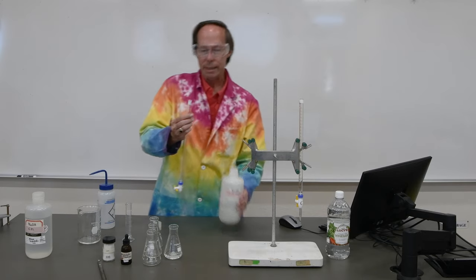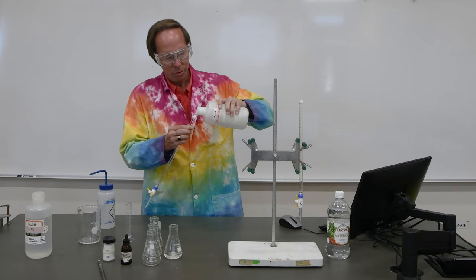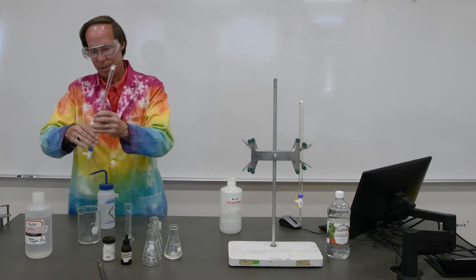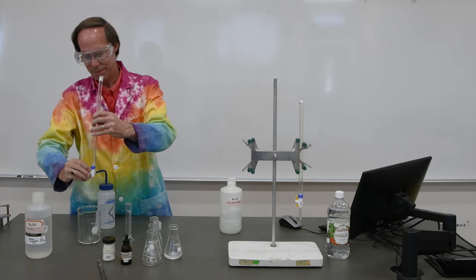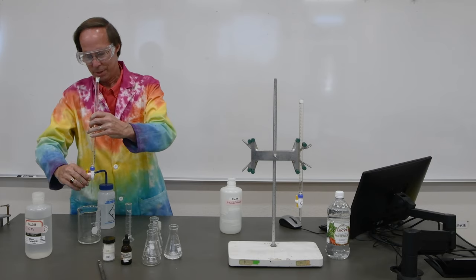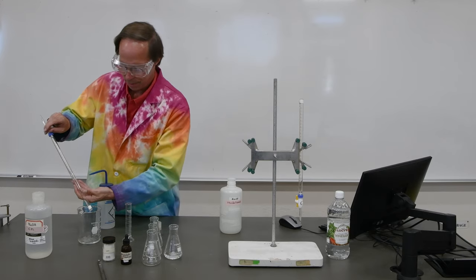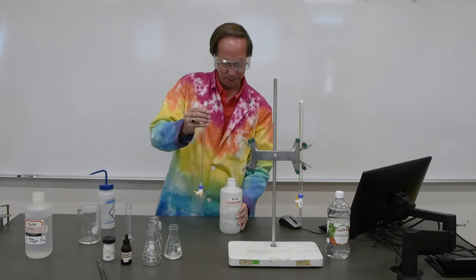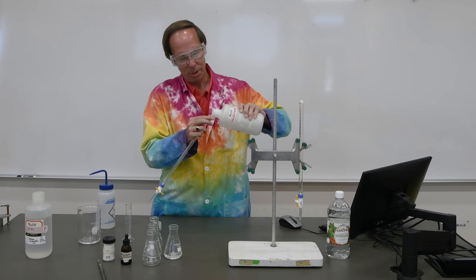Let's go ahead and do that again. It's always a good idea to put in two rinsings here to make sure there's nothing in the burette except the sodium hydroxide. So again, let's swirl this around a little bit to rinse it. Let that drain out. And now we're ready to fill it. So now there should be nothing in the burette except our diluted and soon to be standardized sodium hydroxide.